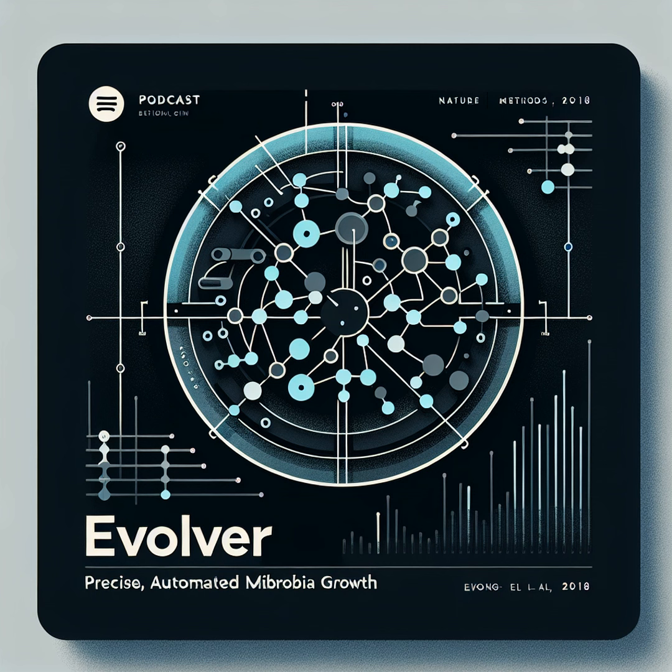eVOLVER's high-throughput capabilities also significantly benefit functional genomics research. Imagine screening a whole yeast knockout library under different conditions, like varying temperature, to determine how gene knockouts affect temperature sensitivity. This level of investigation was just not feasible before. That's an amazing application. It really highlights how eVOLVER enables a whole new scale of experimentation. Could you give us a specific example from the paper to illustrate this?